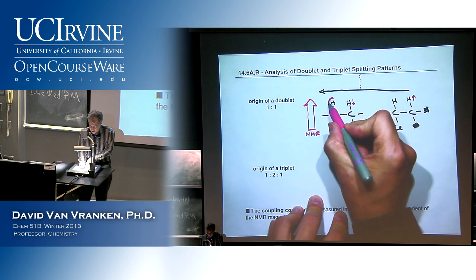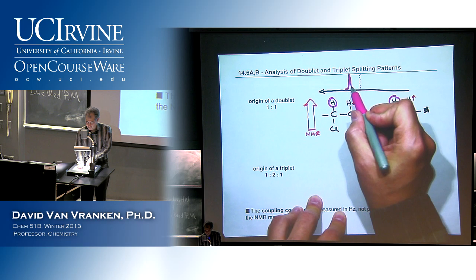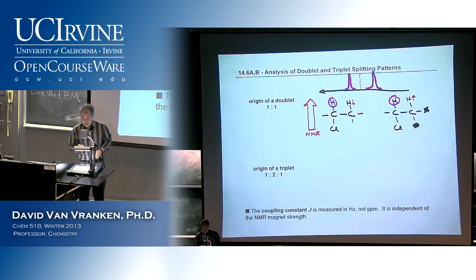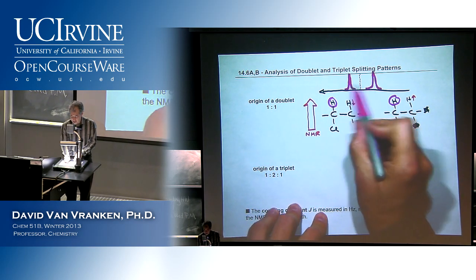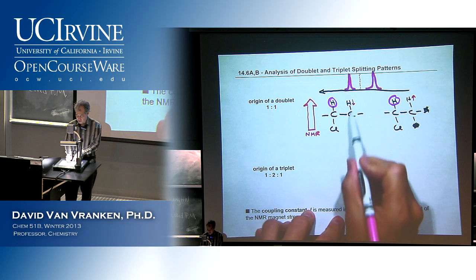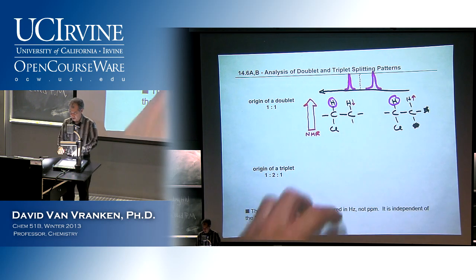This proton that I've circled now will end up with two different chemical shifts because it's affected by its neighbor. One of the peaks will be higher by a certain amount, by a certain frequency. The other peak will then be lower by a certain frequency from the original value. And we call this difference, this change, splitting. And so you can see how you end up with this doublet splitting pattern, because there are two and only two possibilities here. So again, the populations aren't exactly 50%, because the NMR magnet tips this. It's like 50.001% and 49.9%, but you'll never see that difference just by looking at those two peaks.